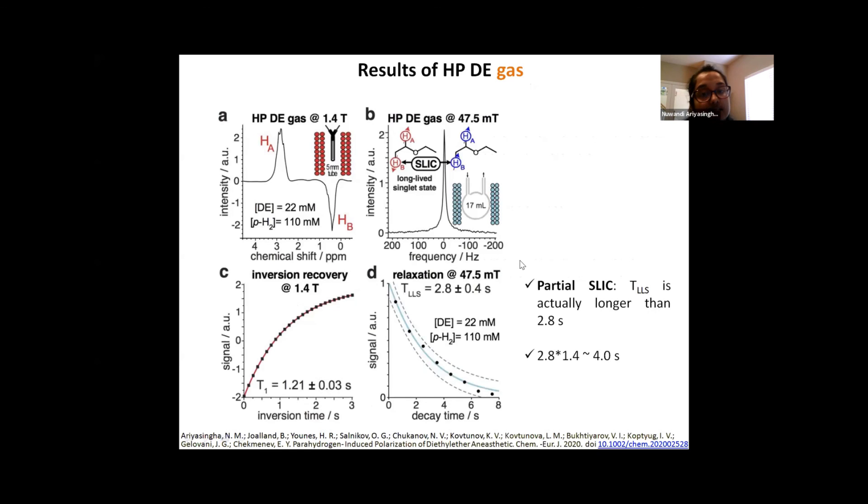So these are the results of the diethyl ether gas. The plot A shows the typical hyperpolarized spectrum acquired at the 1.4 tesla. And its inversion recovery data suggests a T1 of 1.2 seconds. And the plot B here is the SLIC spectrum of diethyl ether gas at the low field. And it shows the relaxation data. So by fitting the data, we obtained TLS of around 2.8 seconds. But since this was done using partial SLIC, the actual TLS should be even longer than this, which using the correction factor, we obtained a value of 4 seconds. So we can clearly see the long-lived spin states of hyperpolarized diethyl ether gas can indeed be produced by using this approach.